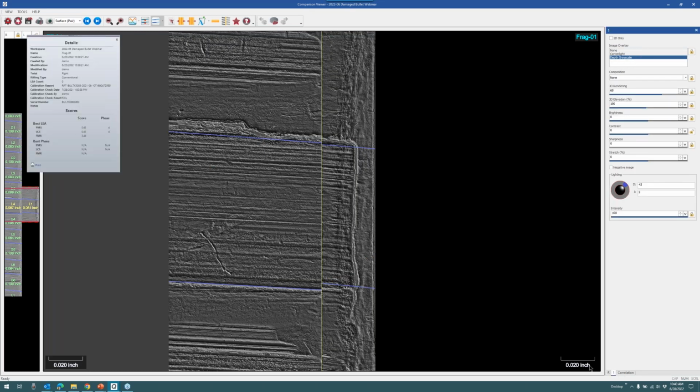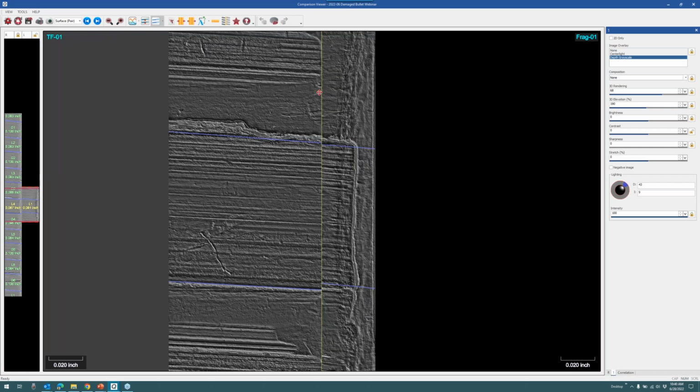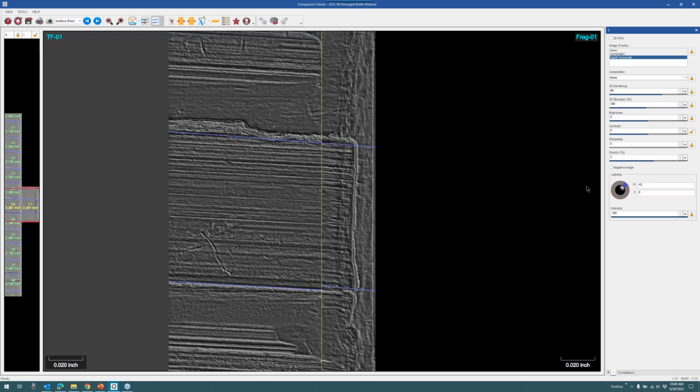Test number 1, I'm now using the test tool here, and let me just close this. With test number 1, I can play with the stretch here, and if you look at the image on screen, I can give it 1, 2, maybe 3 clicks here to undo the compression that took place from the impact. And so you have a chance to temporarily repair deformations that took place from impact, like what happened with this fragment.